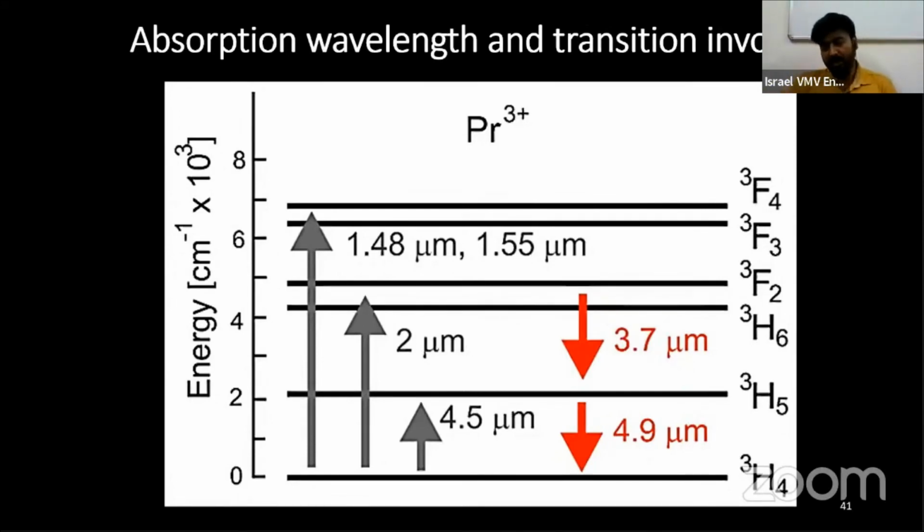They have characteristic absorption. So these elements have been used in organometallic complexes of various forms and geometries. They are applied in various fields: light emitting diodes, many electronic applications, displays, phosphorescent screens.